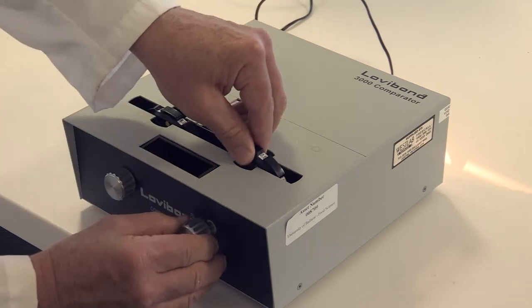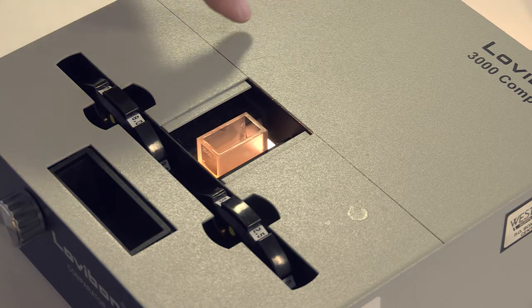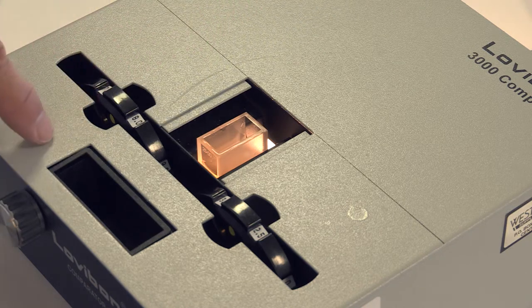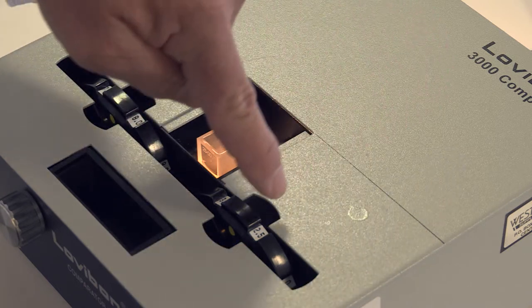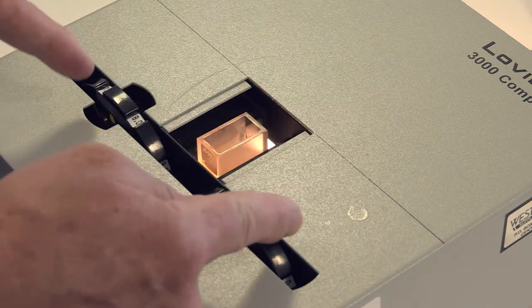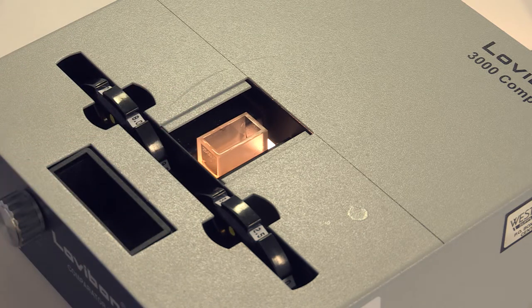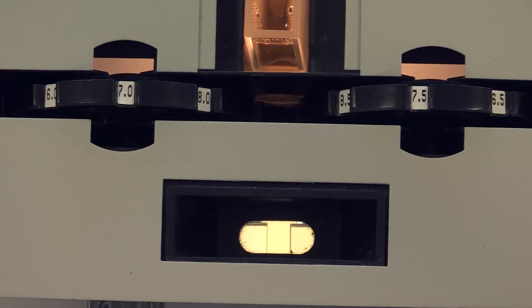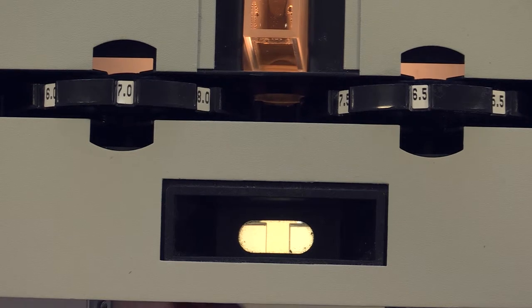We place the appropriate discs in the comparator in the correct orientation. In the colour comparator a beam of light is split in three directions. The first goes through the left hand colour disc, the second goes through the sample, and the third goes through the right hand colour disc. The three paths are brought together through a prism so that they can be visualised side by side. We visualise this through the comparator where there are three windows: left hand disc, sample, right hand disc.